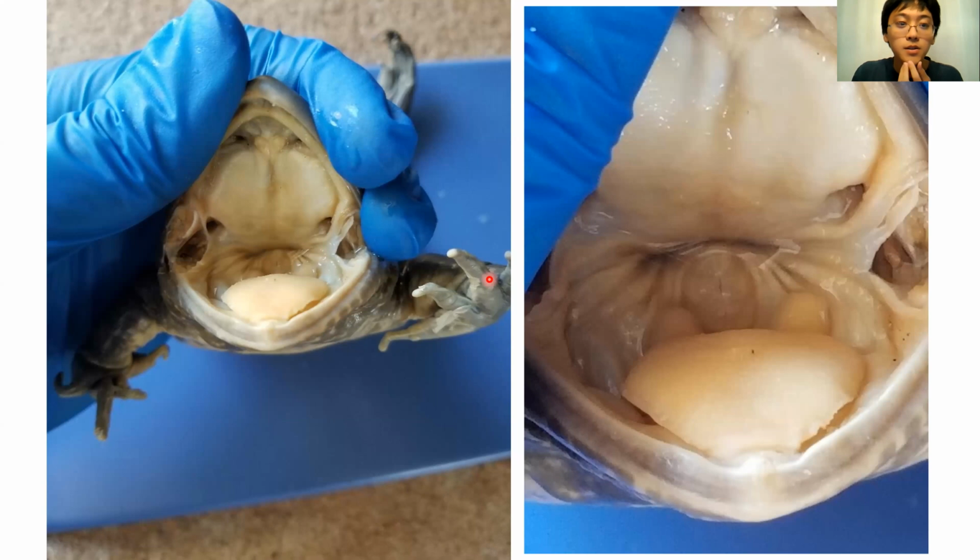Okay, so the mouth has most of what's left for the external anatomy. Frogs have two sets of teeth on the upper portion of their mouth. Obviously, since they only have it on one side, it's not really for chewing, it's for holding their prey in place. This layer of teeth, the one closer to the outside, those are the maxillary teeth. And these two over here, there's only two, I believe, are the vomerine teeth.